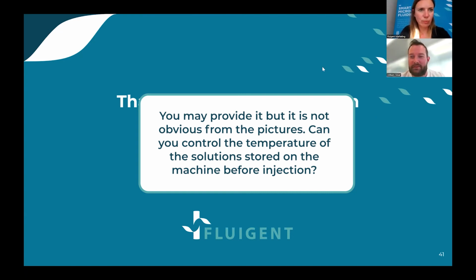Yes, I can answer. So hello, everybody. So the machine itself right now cannot heat the solution and keep it heated before injection. So there is no temperature control associated with it. We are currently thinking of an accessory that we will be able to adapt to the reservoir so that this becomes possible, but right now it is not possible.